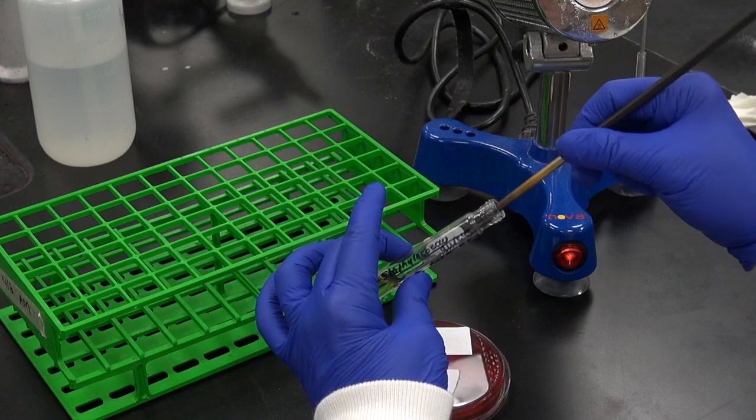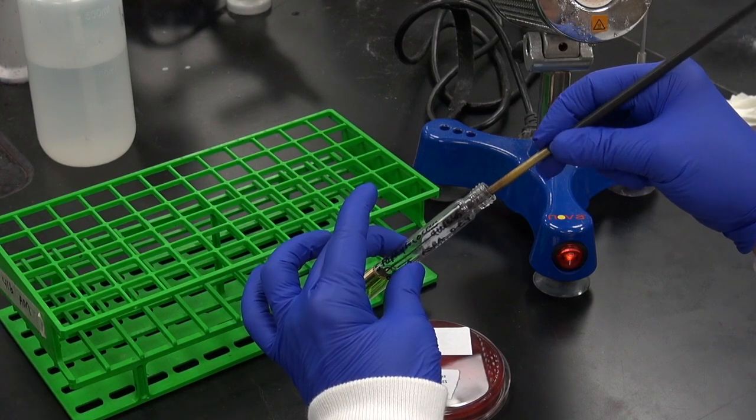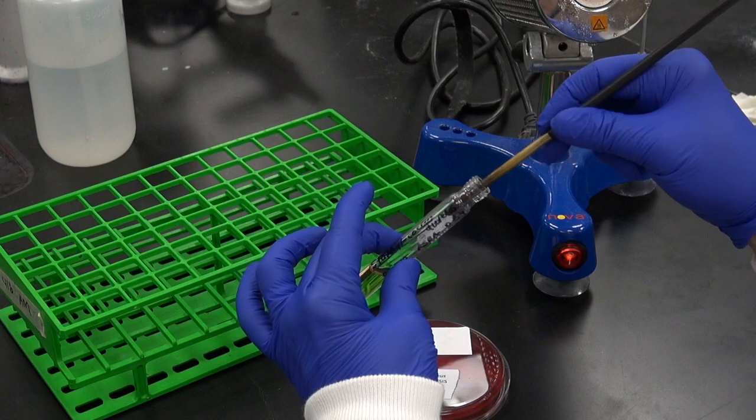Once the loop is submerged in the broth, twist it back and forth between your fingers to release the bacteria into the liquid.